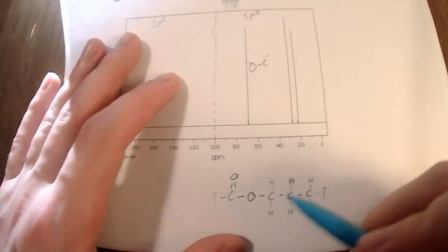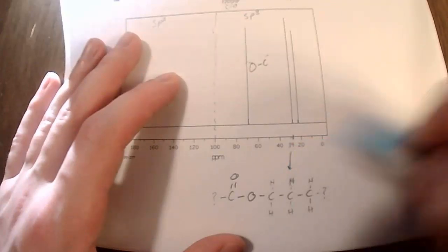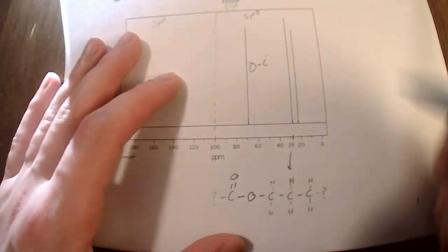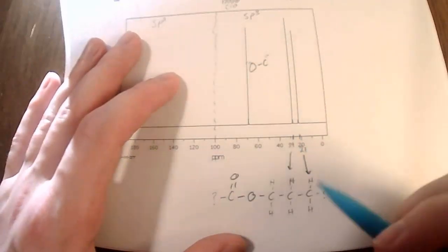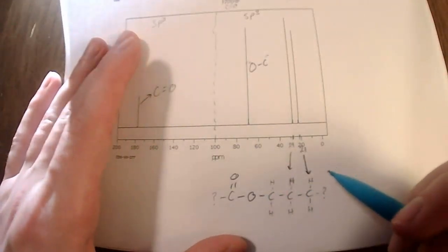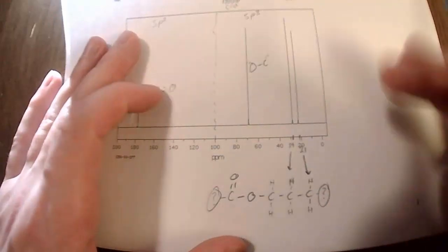Now as far as the other two, our rough diagram shows the next peak at about 29, would just be a little bit further away, so maybe once removed from the ester oxygen. And we see a very close peak beside it at about 21, which would mean even more removed from the ester oxygen. So far, everything's lining up, but we don't know what's going on here.